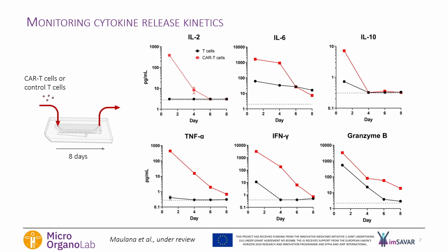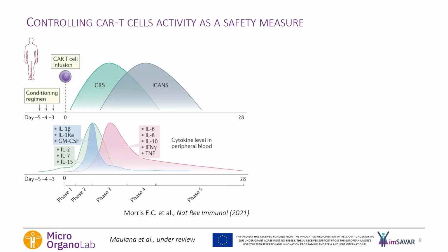So what is interesting here is that we were actually able to mimic not only the level of the cytokines being released clinically, but also the kinetics of the cytokine release happening in patients that suffer from cytokine release syndrome. So moderate cytokine release is actually good and predicts efficacious clinical outcome, but too much and too long could be deadly for the patient.